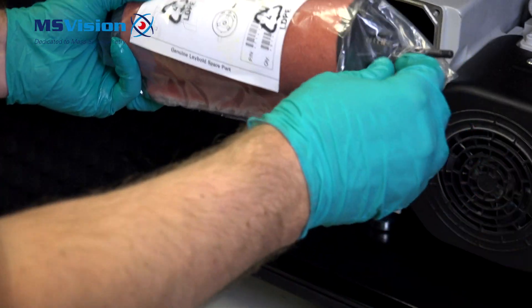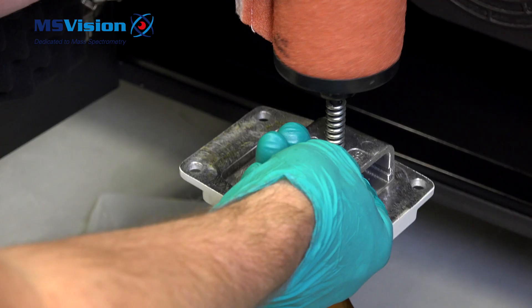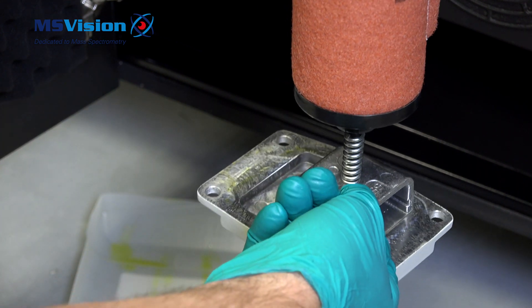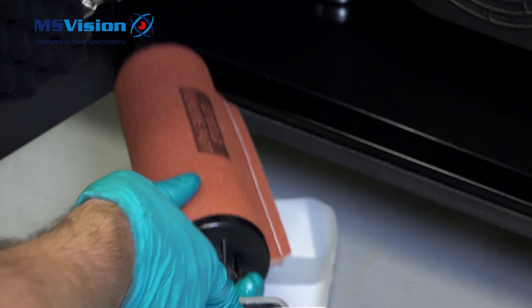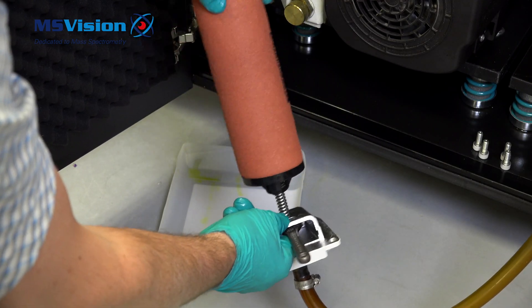Take the new filter out of the packaging. With a finger, hold the nut behind the bracket and line up the holes. Place the spring over the filter and screw into the nut by hand. Once started, hold the nut with the spanner and completely tighten.